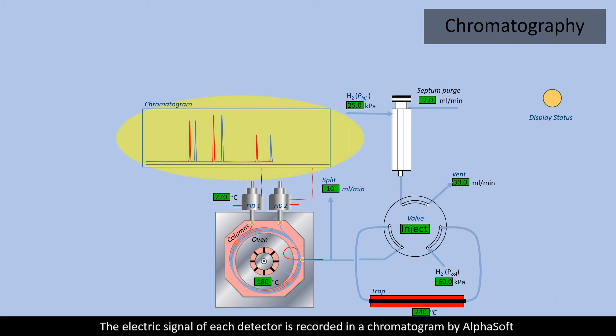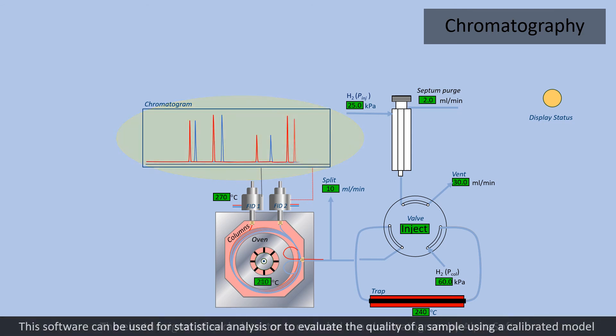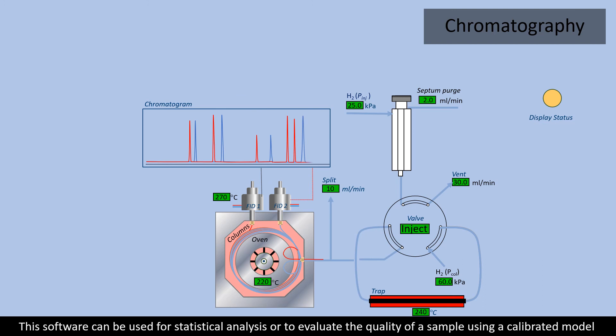The electric signal of each detector is recorded in a chromatogram by AlphaSoft. This software can be used for statistical analysis or to evaluate the quality of a sample using a calibrated model.